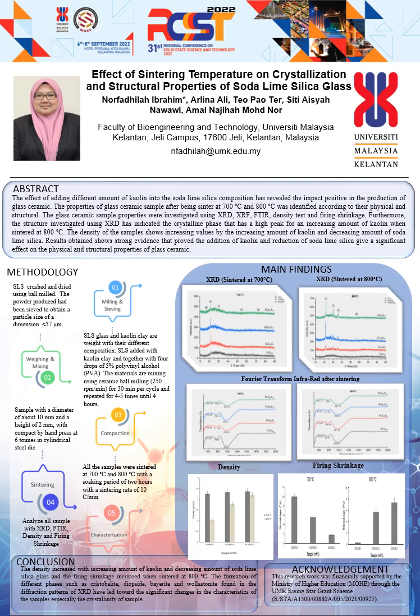Assalamualaikum and hi. The project is about the effect of sintering temperature on crystallization and structural properties of soda lime silica glass. In this project, the effect of adding different amounts of kaolin into the soda lime silica composition has revealed a positive impact on the production of glass ceramic.